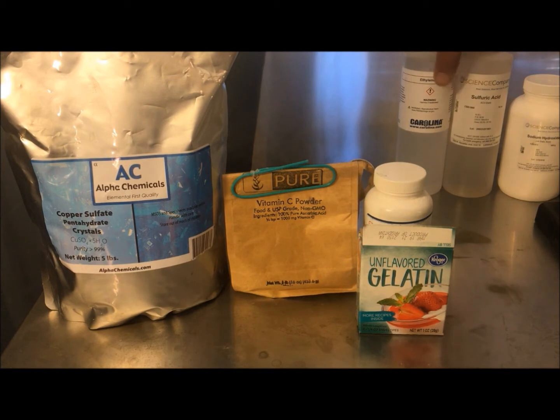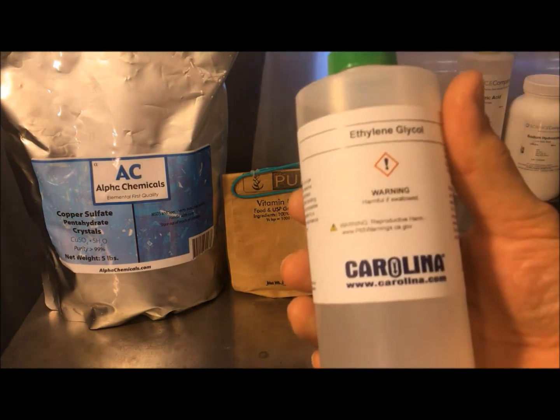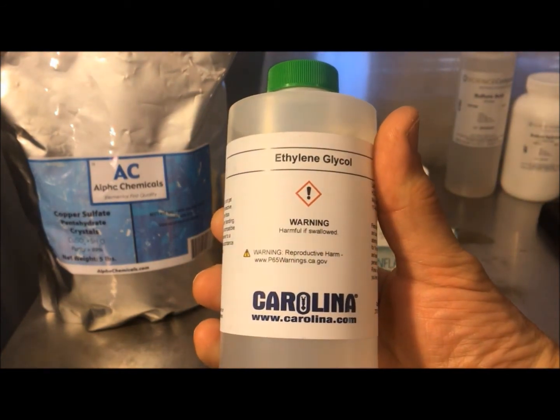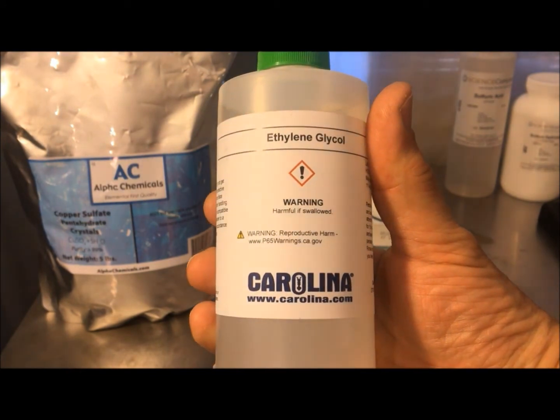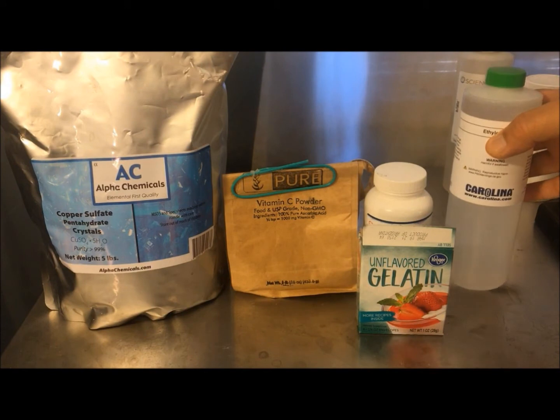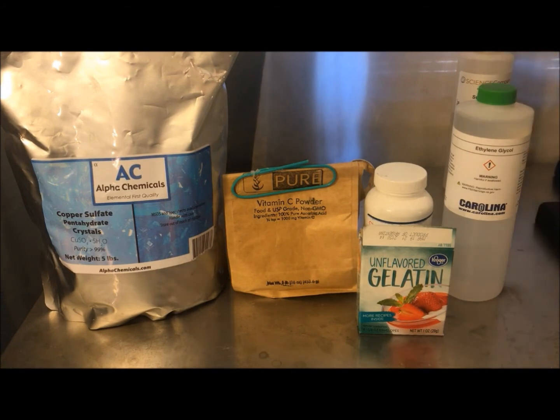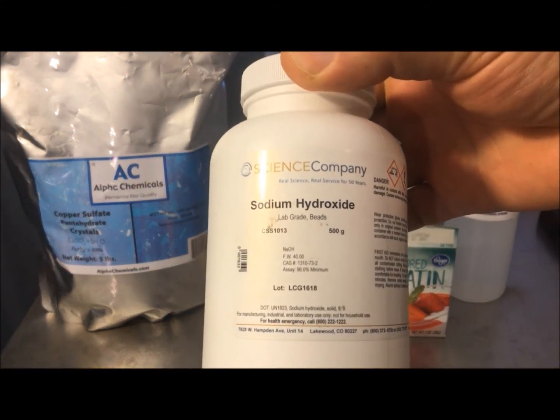Another variable is substituting ethylene glycol for water as the reaction solvent. This can speed up the reaction and reduce the time from 8 hours down to 1 hour, because it also acts as a reducing agent for the copper salt. You can use all kinds of different reducing agents. Sodium hydroxide was suggested in some of the studies.